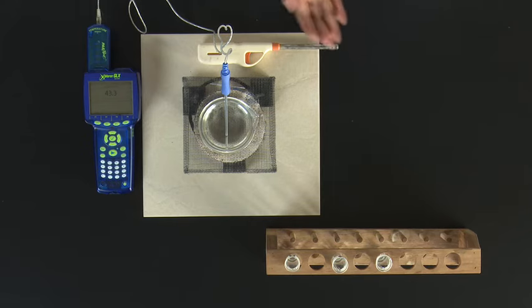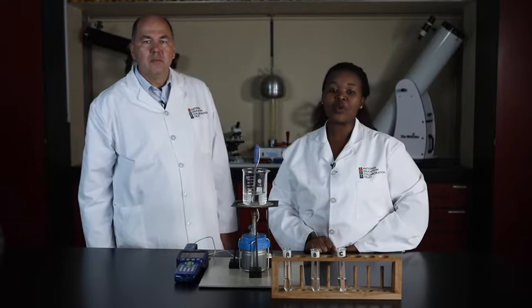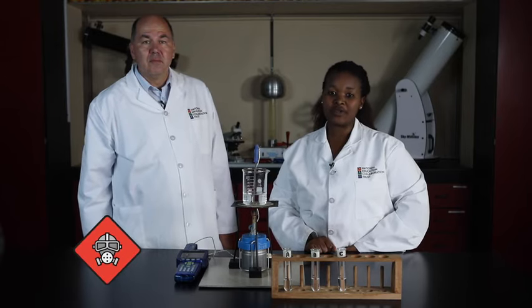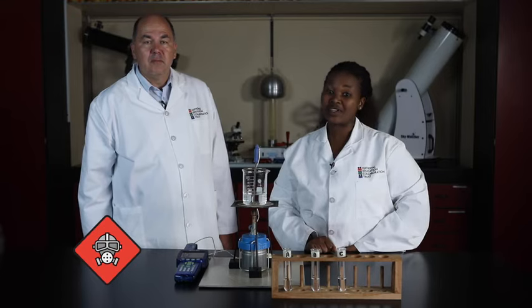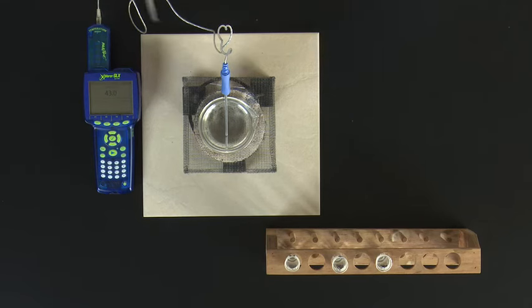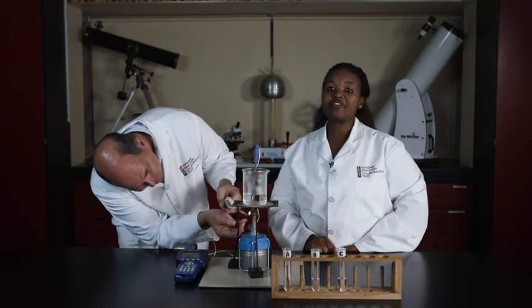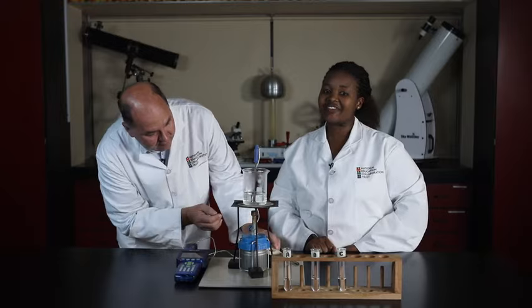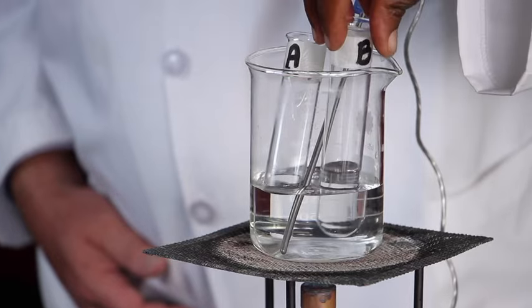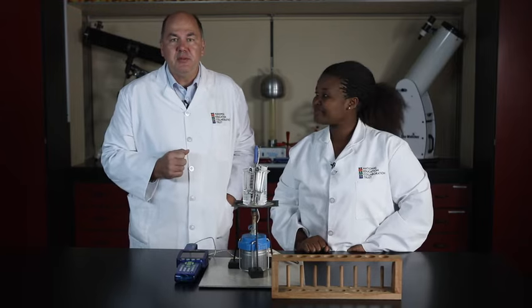Here's our apparatus for this experiment. Let's include a digital thermometer in the beaker so we know what the temperature is when the liquid begins boiling. Take care while interacting with the fumes of acetone and ethanol. They could make you drowsy and they are toxic. Let's start heating the water in the water bath. Remember, we're looking for the first liquid that boils and then we can identify it. Record the observations for these 3 substances in their test tubes.